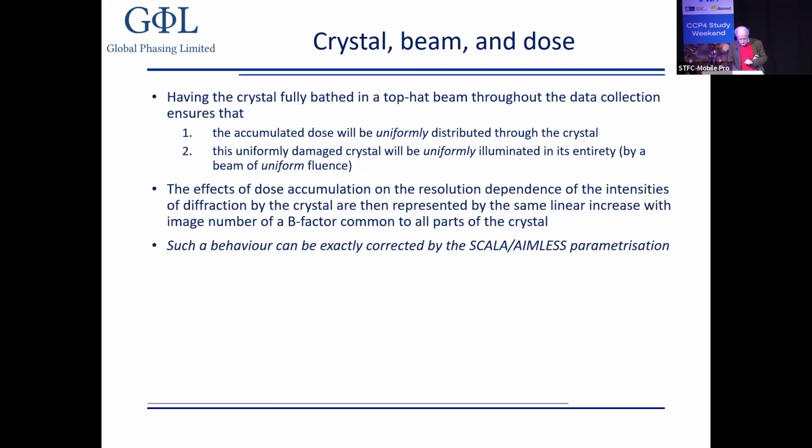And this is exactly the parametrization used for scaling and for compensating decay in the Scala or Aimless program. So that is key to making sure that the data you collect will be optimally scalable and correctable for radiation modification.